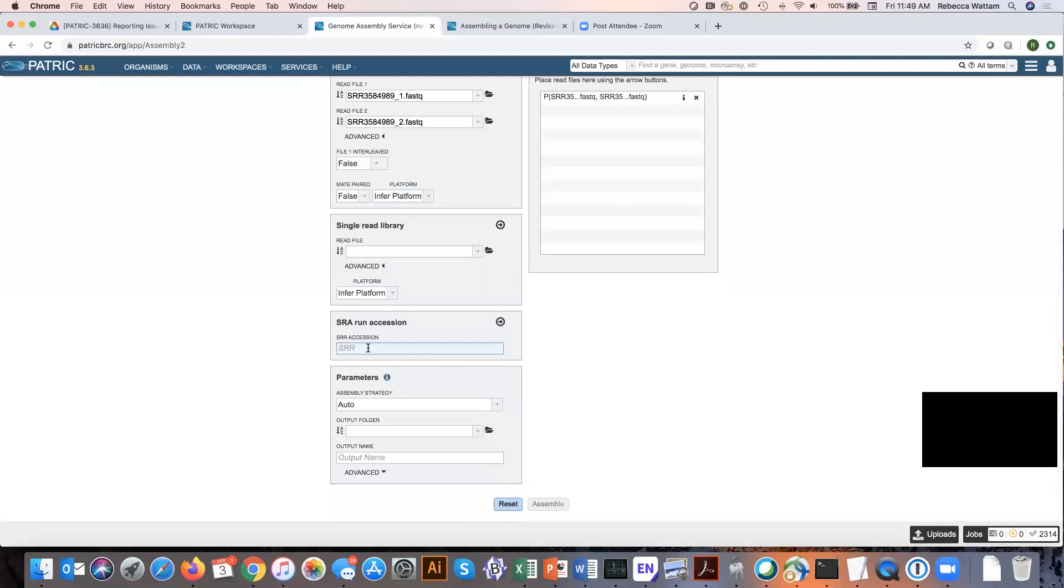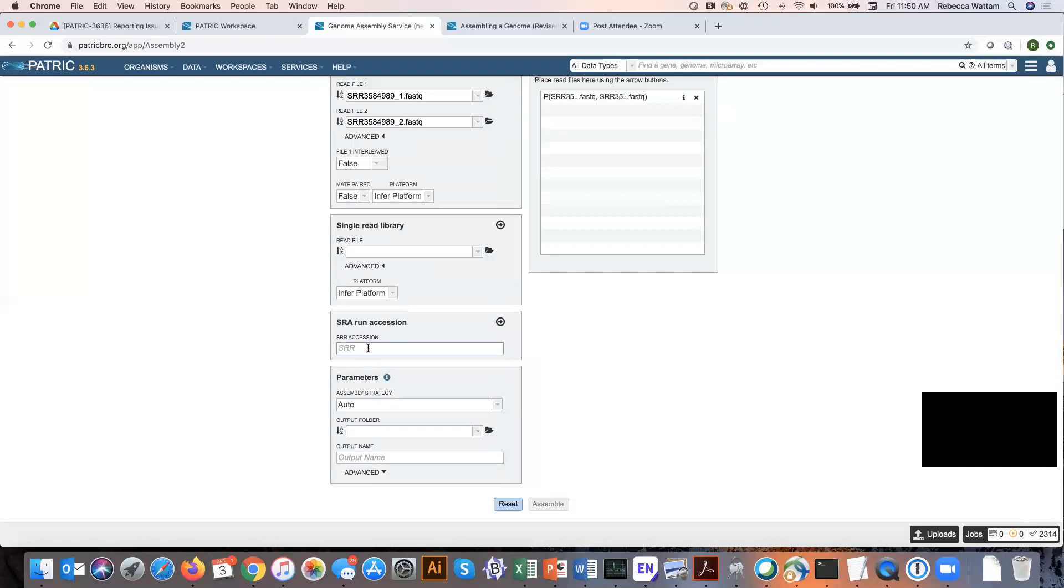Patrick also allows you to submit data from the Sequence Read Archive. Let's say you know an accession number that you want to assemble the data for. Often, because it's sometimes a problem to submit data to GenBank, a lot of people are putting the data directly into the Sequence Read Archive. So the only way you can get access to that data to compare it to your own is by assembling it and annotating it independently. You can use this function to load that data and assemble it. You could either write in the number or cut and paste it from the Sequence Read Archive.